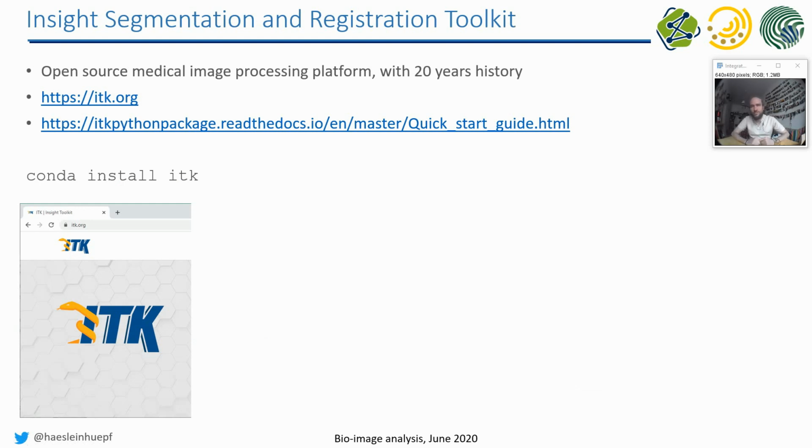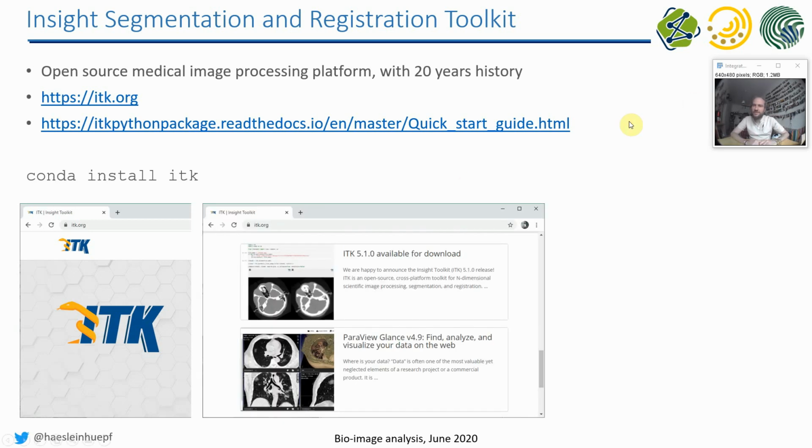One group of people who wanted to deliver 3-dimensional image processing to Python, and also 3-dimensional image visualization, is the people behind the Insight Segmentation and Registration Toolkit, ITK. Conda install ITK brings another package, not much to talk about. With ITK, you can process medical images. ITK has a long history in development. It's a software library which is quite old and is for the medical imaging field.